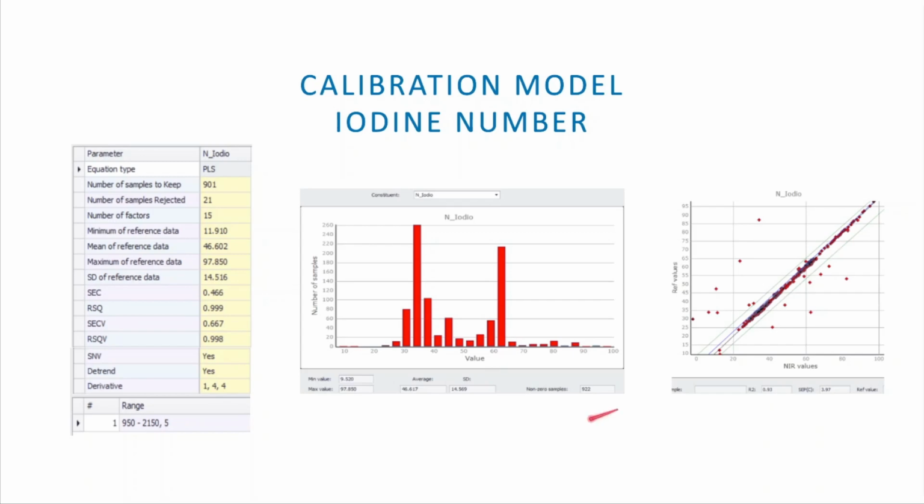We could have defined two extremely precise calibrations, but we would have lost the ability of the calibration to discriminate non-conformities and production changes on the same pipeline. The decision to extend the sampling to values outside the production norm has made it possible to maximize correlation with positive reinforcement on performances. Tolerance is absolutely within the acceptability.